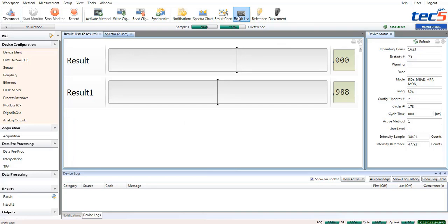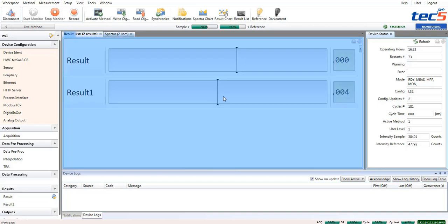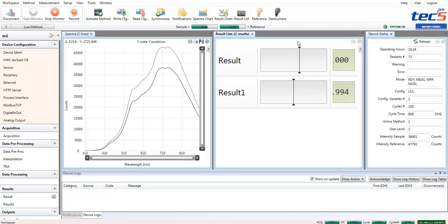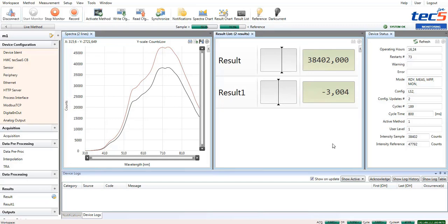Of course, windows may be arranged individually to match the requirements of your application.